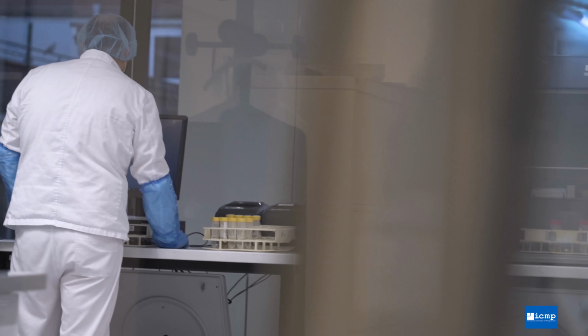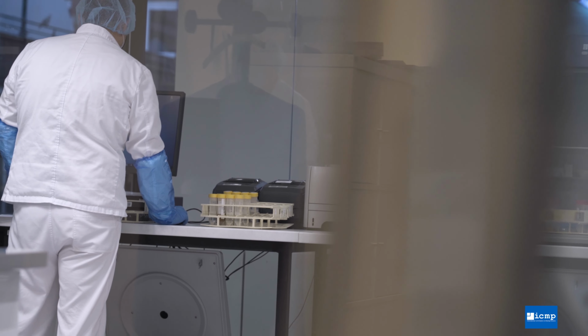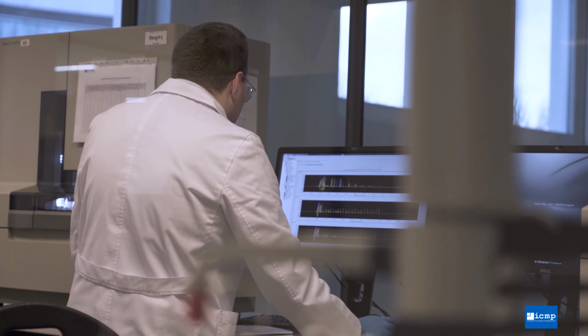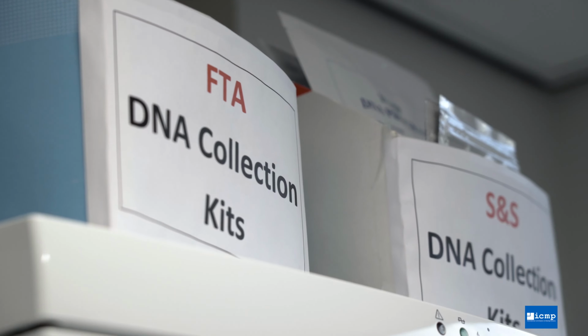In large-scale contexts where persons have gone missing, DNA testing is often the only reliable means to identify those who are missing. In the ICMP DNA Laboratory, similar techniques are employed that are used in forensic DNA laboratories around the world. However, we compare the DNA profiles that we obtain from unidentified remains to those of family members. This is done on a large scale using separate databases for both unidentified remains and family members.